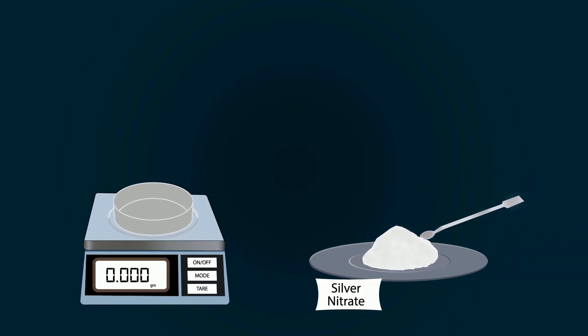Start adding silver nitrate with the help of spatula into the petri dish. You have to measure precisely up to 3.397 grams.